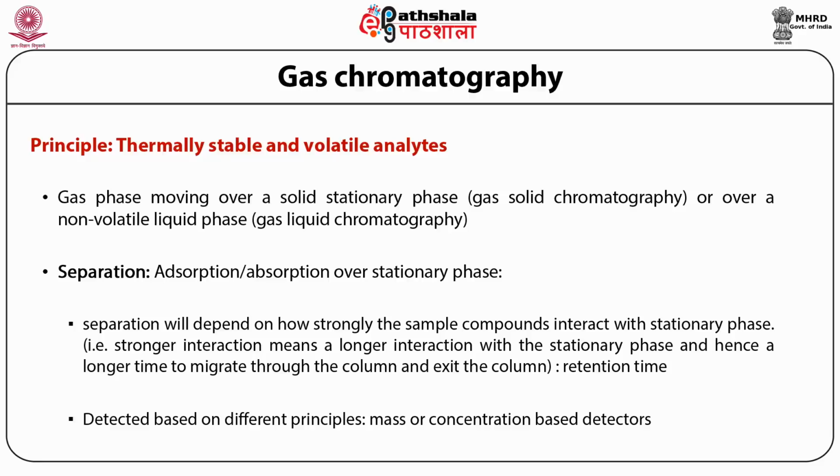Also, these detectors may be mass or concentration based, and we shall shortly see the wide range of detectors that are available to be linked to the column and which are used based on the selectivity that you desire for your mixture and the expected nature of your sample.